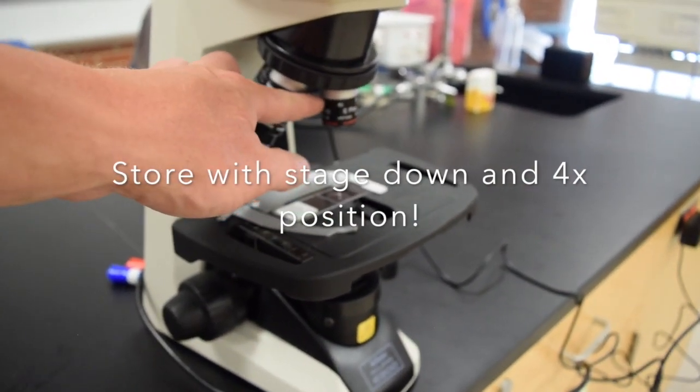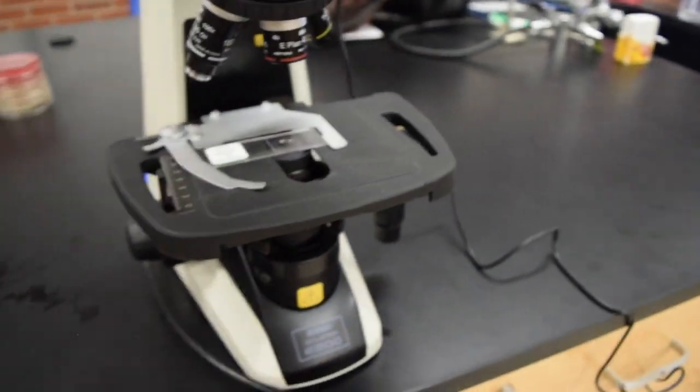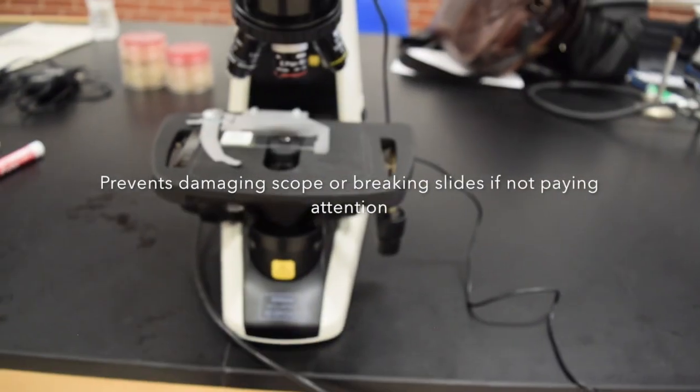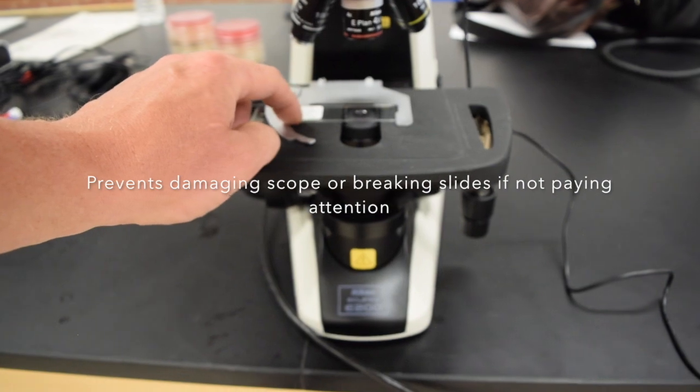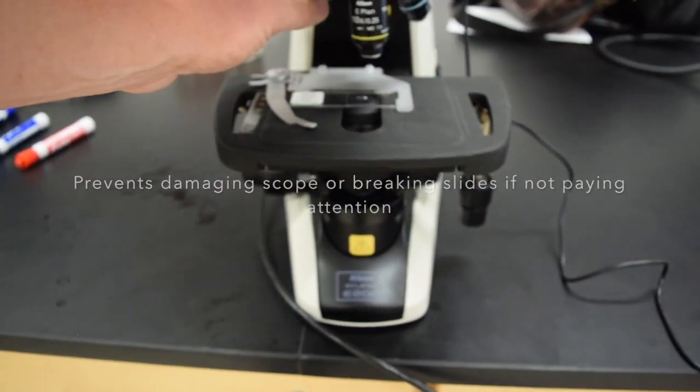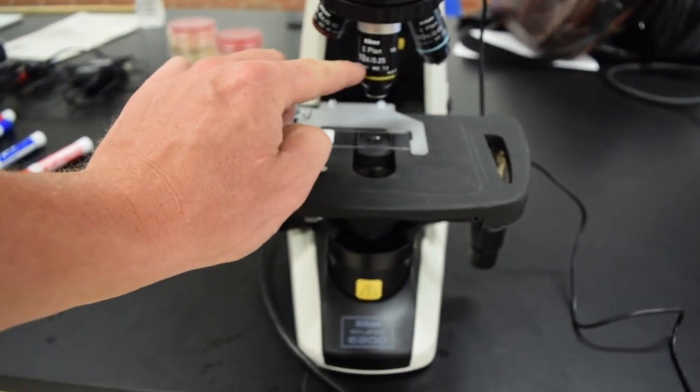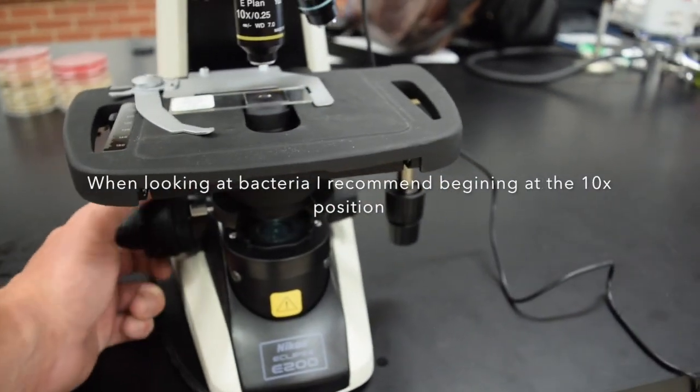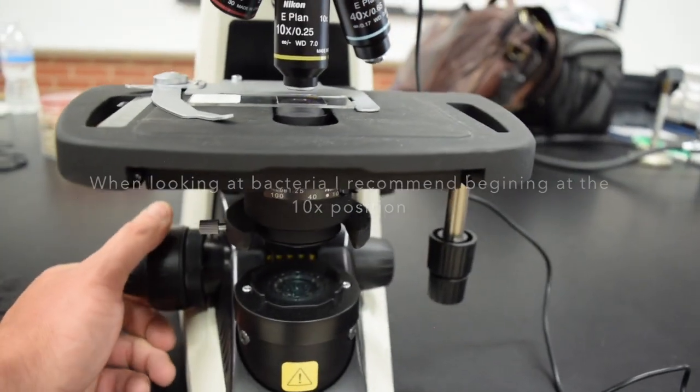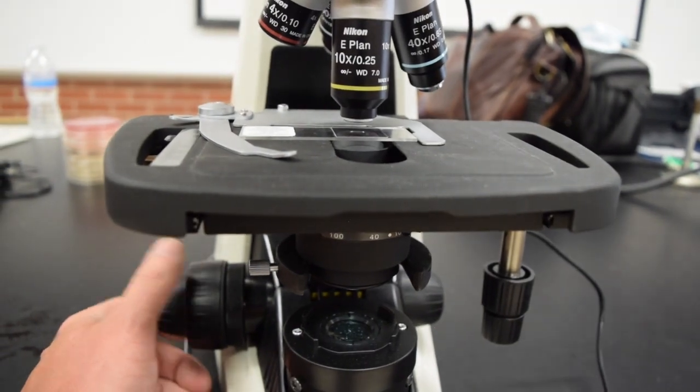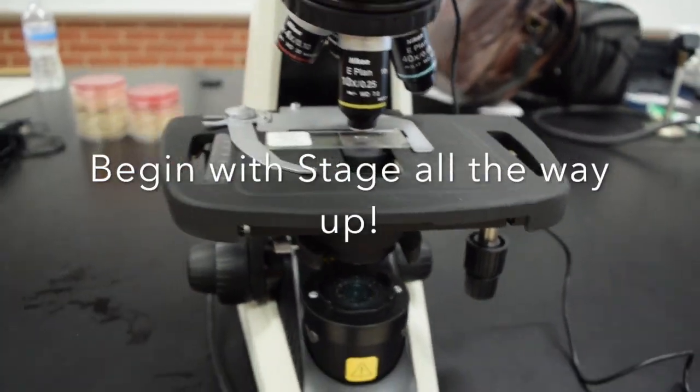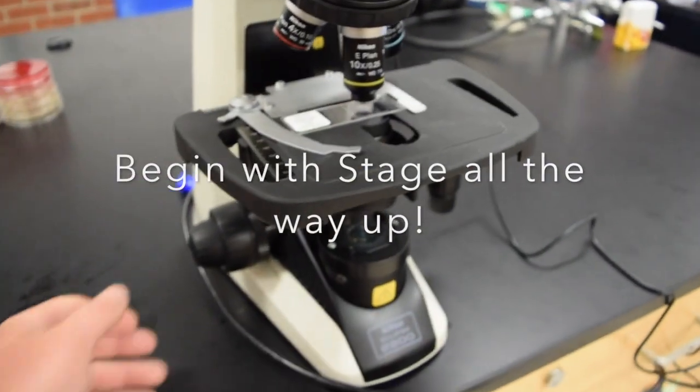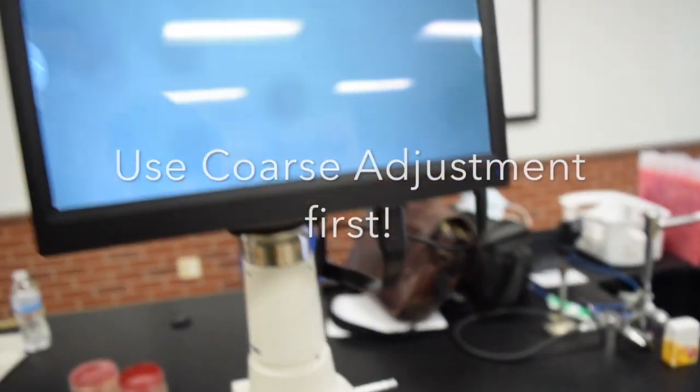When we start, we're going to start at low power. This is a bacterial shape slide, so I'm going to start at the 10x position and move the stage all the way up. The stage is all the way up and there's a gap between the slide.